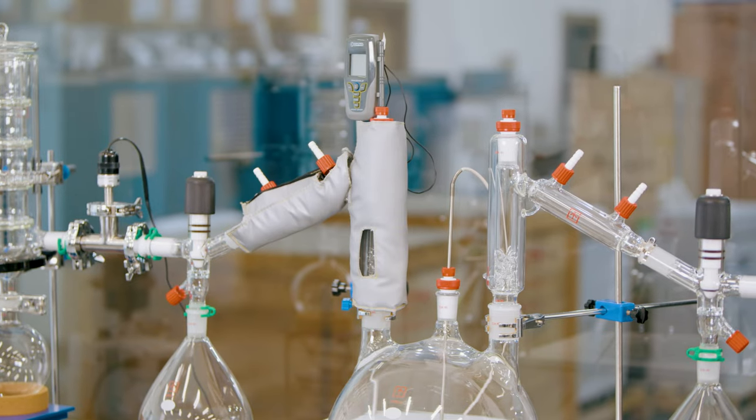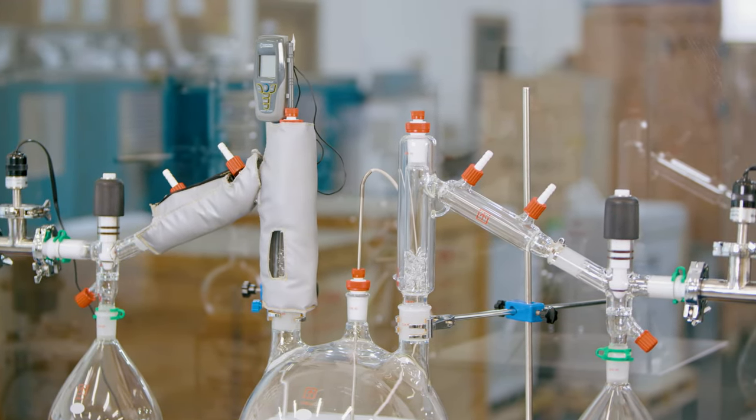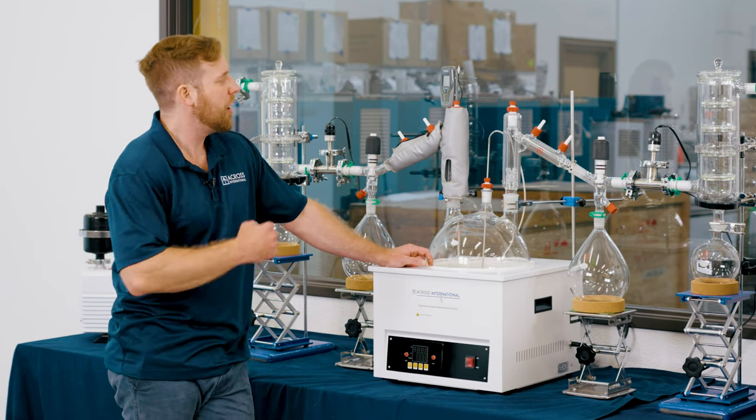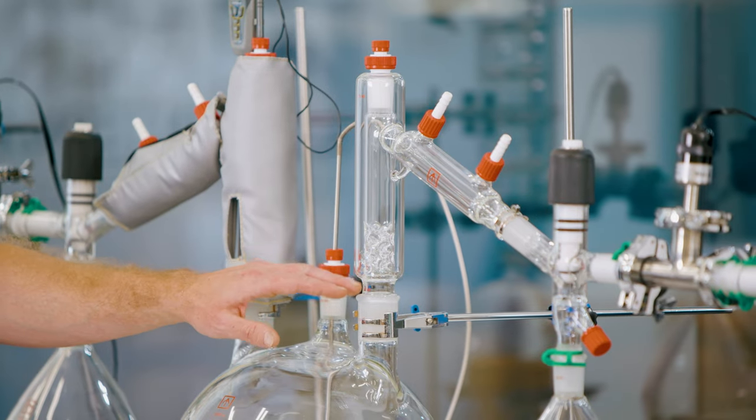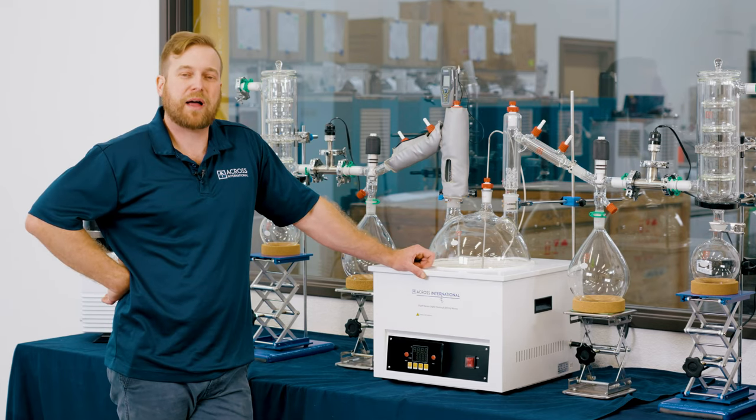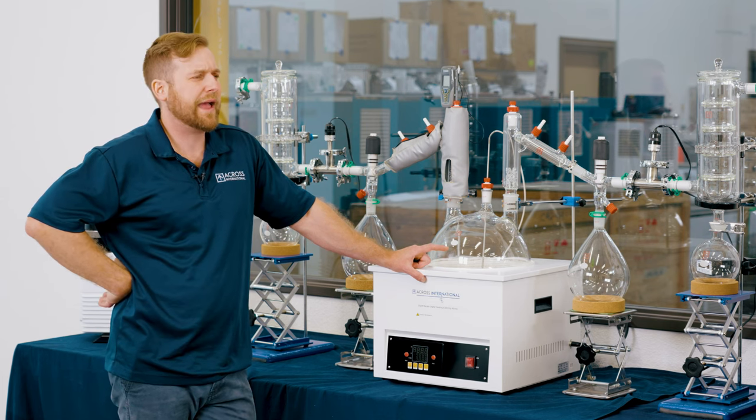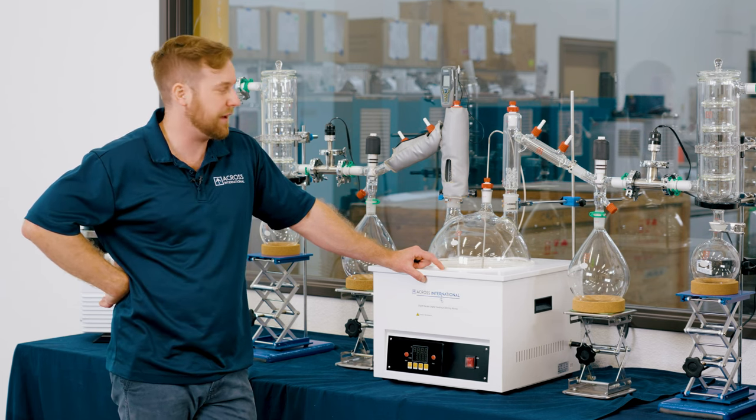Now at Across International, we have two different versions of condensers that you can utilize. Both are universal, so they can be used on all sides of our systems. One is our patented five Vigreux column, and the other is a column that allows for customizable packing. You'll be able to put your Raschig rings in there and customize the packing within that unit.